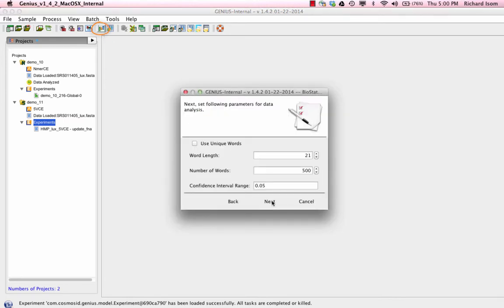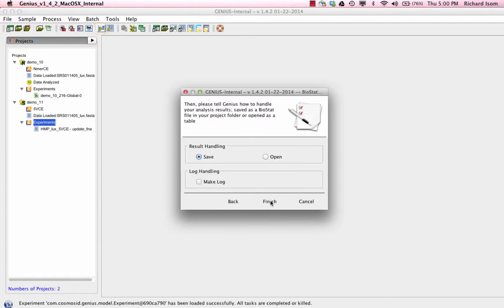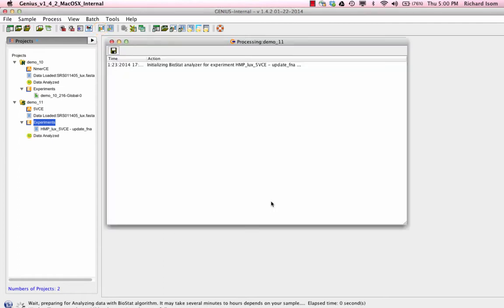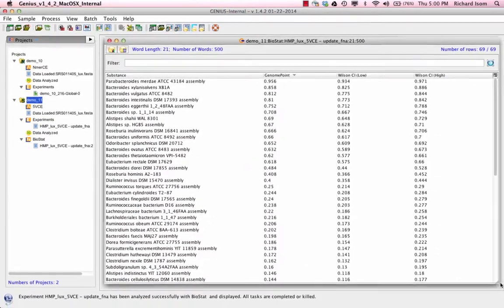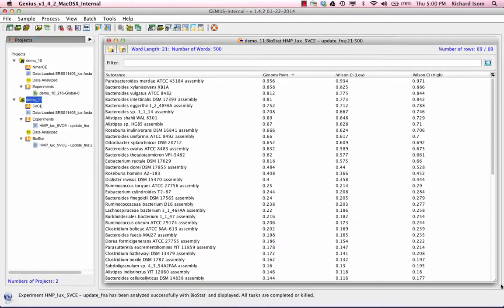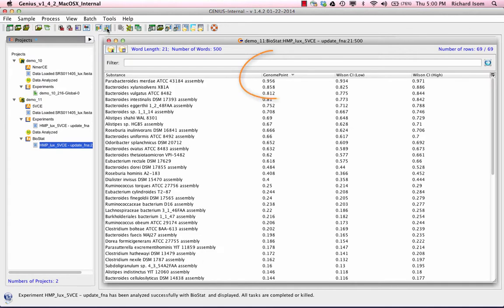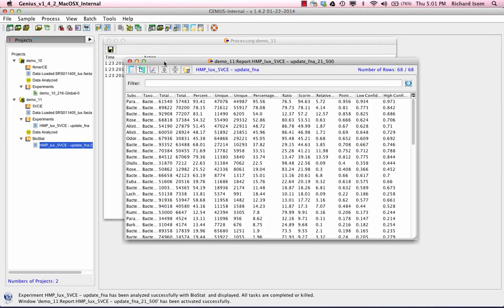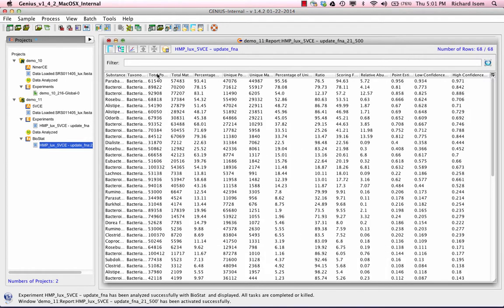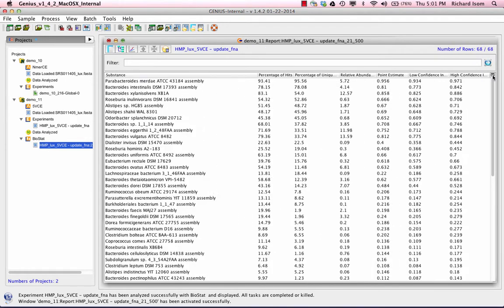In Genius, once you have identified a community of organisms, we can assign some statistical values to validate those calls. Biostat is a package included in Genius that can be run to assign point estimates and confidence intervals for each organism identified and these statistics can be merged into the final results with the original calls.